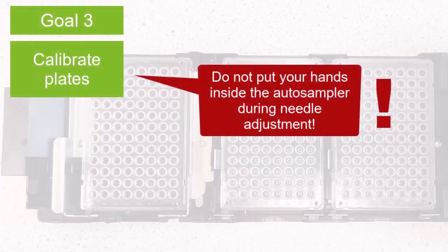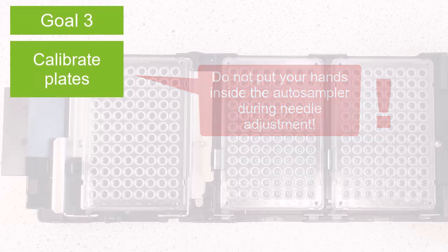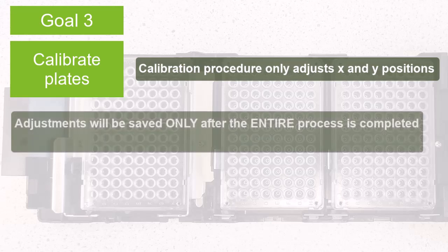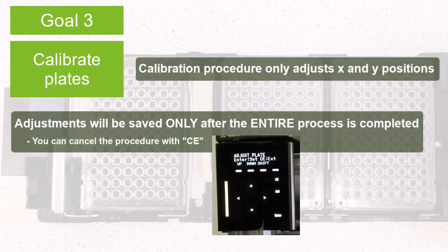Now we are ready to start with the actual calibration procedure. Remember that this will only adjust the X and Y position of the injection needle. Note that each position adjustment will only be saved once the entire process is completed. If you want to cancel a procedure partway through, click CE. Your changes will not be saved.